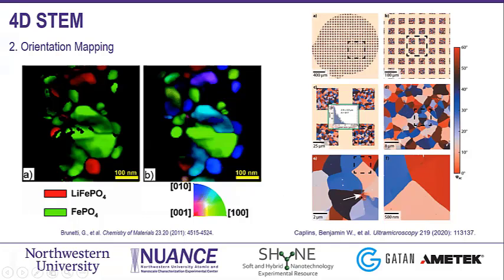Another nice example that just came out was using a 4D STEM approach under SEM, in transmission mode. It uses low voltage and it is still possible to classify a large area and a bunch of different grains, in graphene in this case, just to show the large possibility of applications for orientation mapping, and for different voltage ranges too.